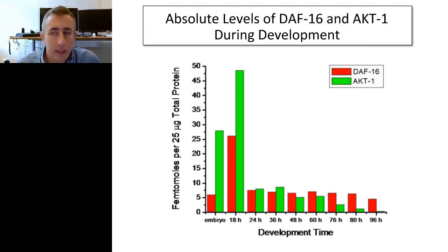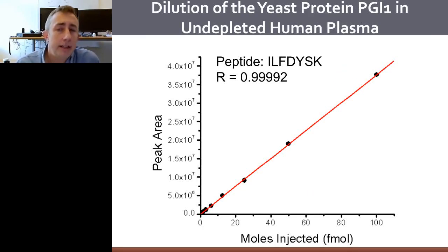So this is pretty exciting to us. This was pretty much a game changer. We now knew that there's no shortage of hypotheses. We just now need to be able to go and rapidly test these hypotheses without having to generate antibodies for each individual target protein. The other thing that's pretty powerful in this is that the quantitative linearity is pretty much unmatched by any other analytical technology.